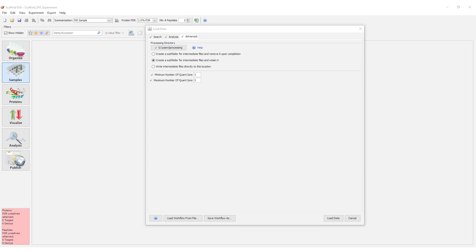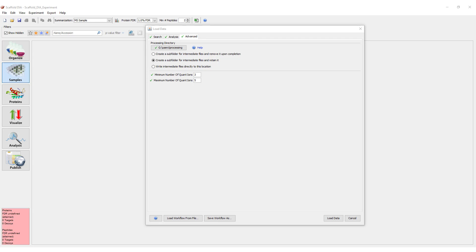Before data can be loaded for the first time, a processing directory must be selected and the behavior must be defined. The processing directory stores intermediate files created by DIA during the search. Choose a location where you have a lot of disk space available.